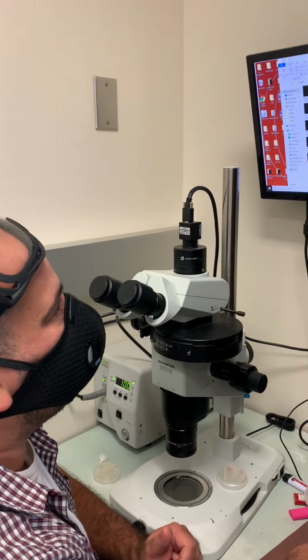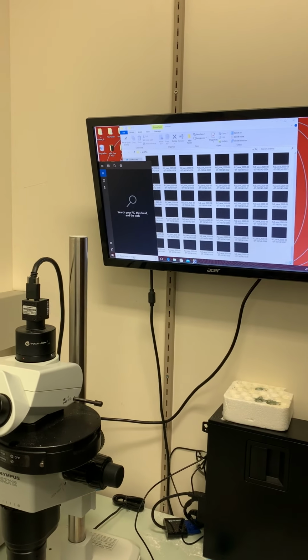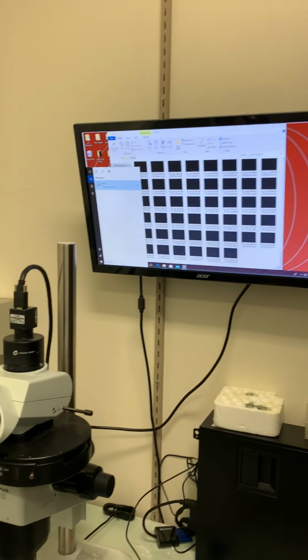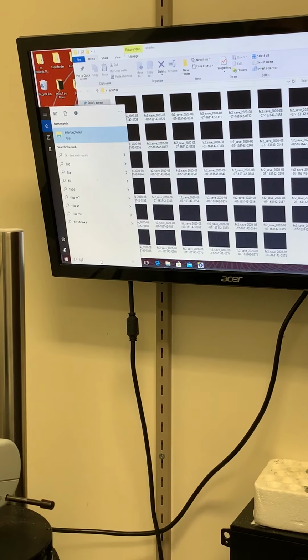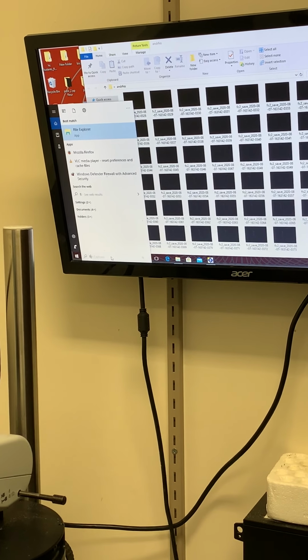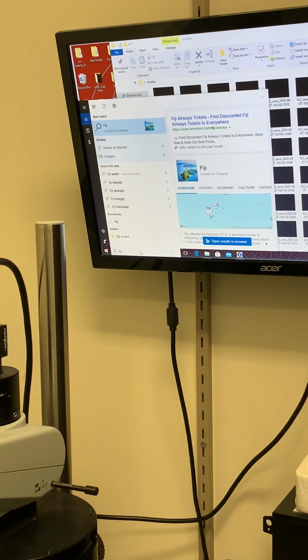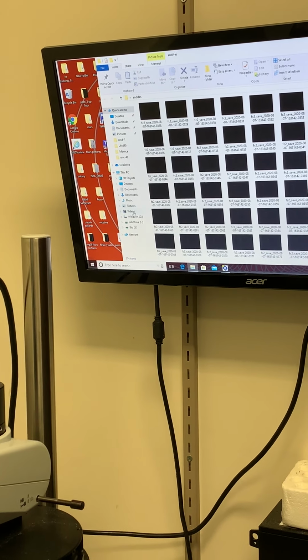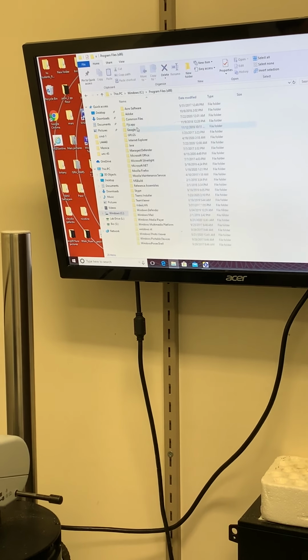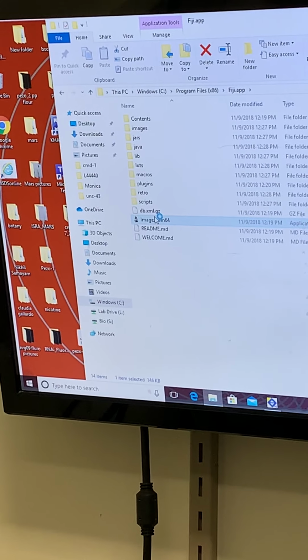So we are gonna now go to Fiji. Hopefully it's here. Fiji. Okay, maybe I had to go to Windows, Program Files, Fiji app. There we go.